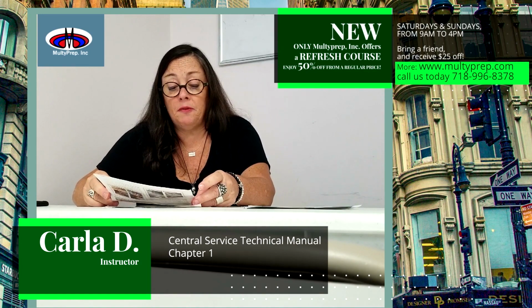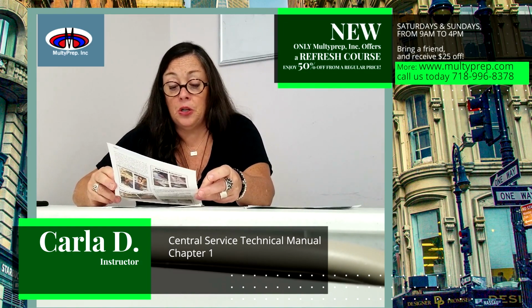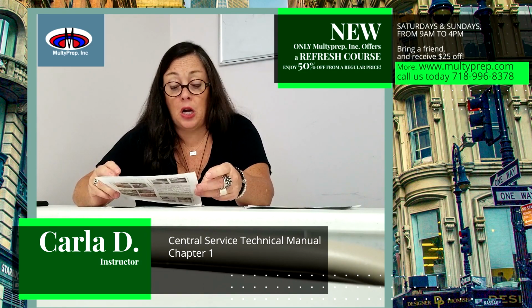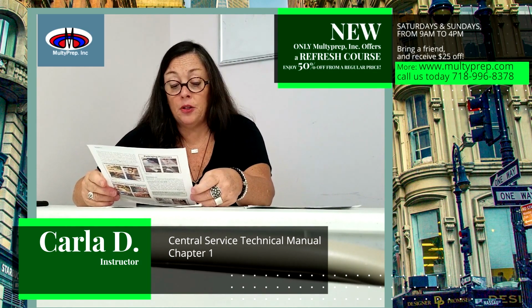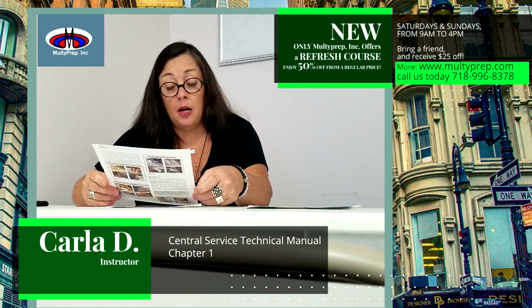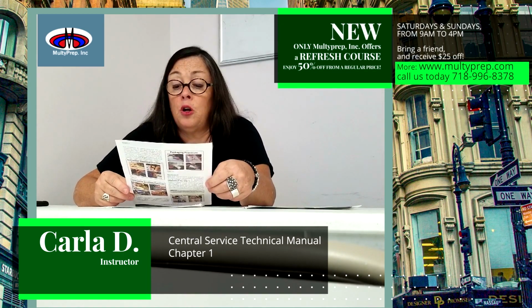Policies and procedures must be developed and followed to ensure that work practices minimize employee injury and exposure to pathogens. To meet the facility's Occupational Safety and Health Administration, OSHA, safety requirements, CS technicians must wear special attire called Personal Protective Equipment, PPE. PPE minimizes exposure to bloodborne pathogens and other contaminants. PPE includes a fluid-resistant face mask, eye protection, a fluid-resistant covered gown, general-purpose utility gloves, and fluid-resistant shoe covers.